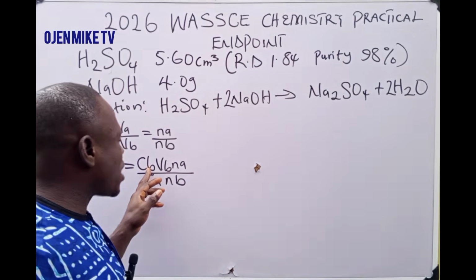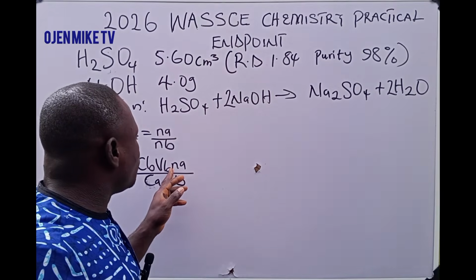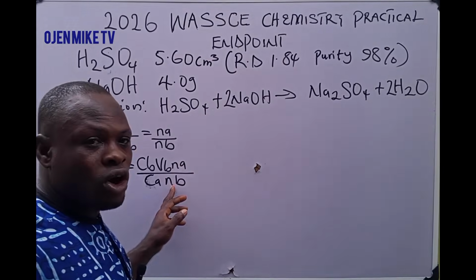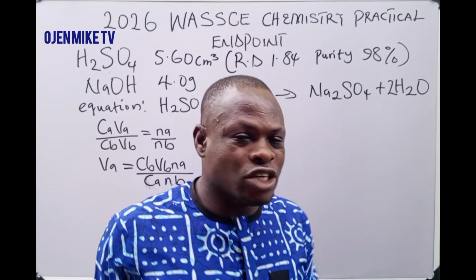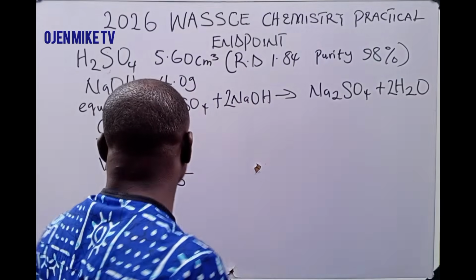We are going to look at our concentration of base, concentration of acid, volume of base, and mole ratio of acid to base. Then you now have your endpoint. Is that understood? Now stay carefully as I drive you through it.